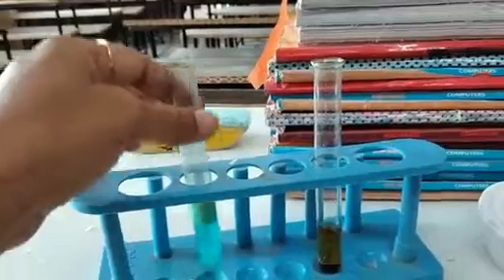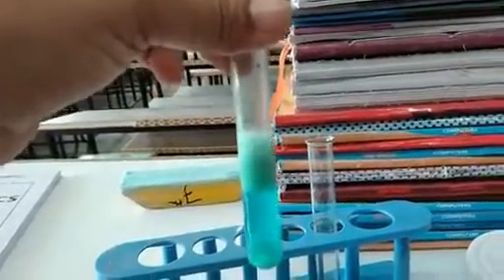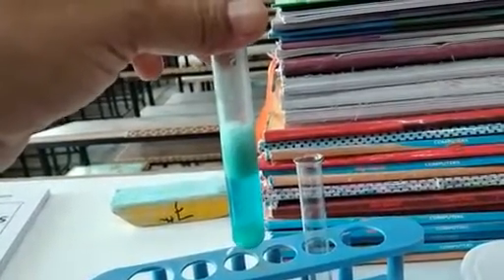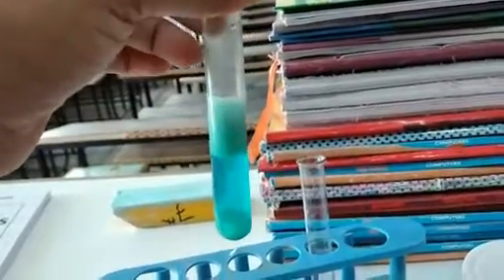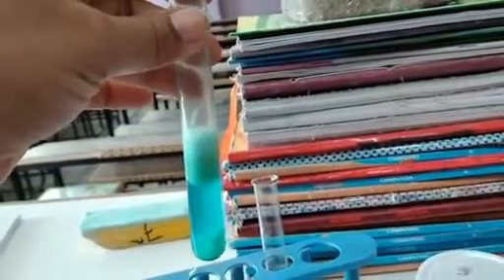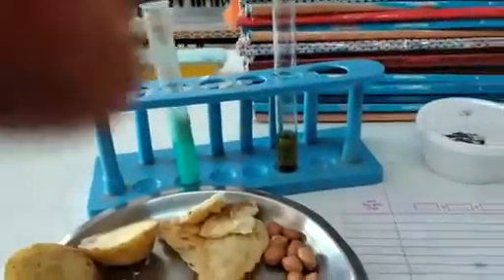For the protein test you can see I have taken copper sulfate solution and I have added caustic soda to it, and after preparing a solution of caustic soda and copper sulfate, I have put a few pieces of peanut and rice in this solution. I am shaking it properly and then I have to leave it like this for a few minutes.